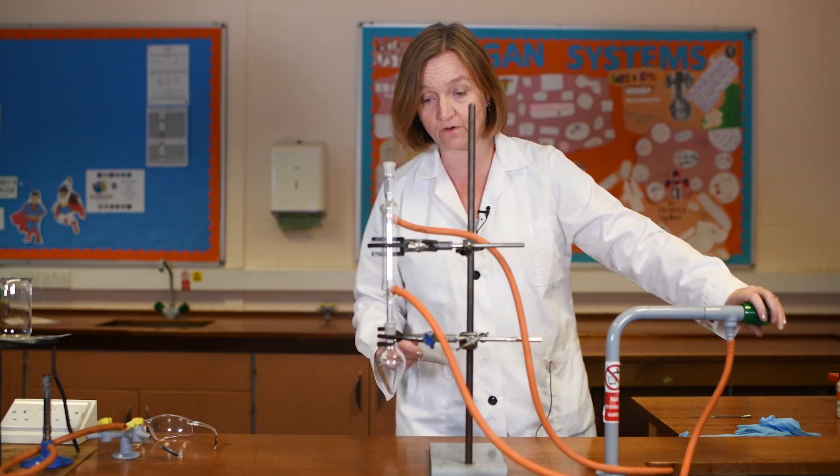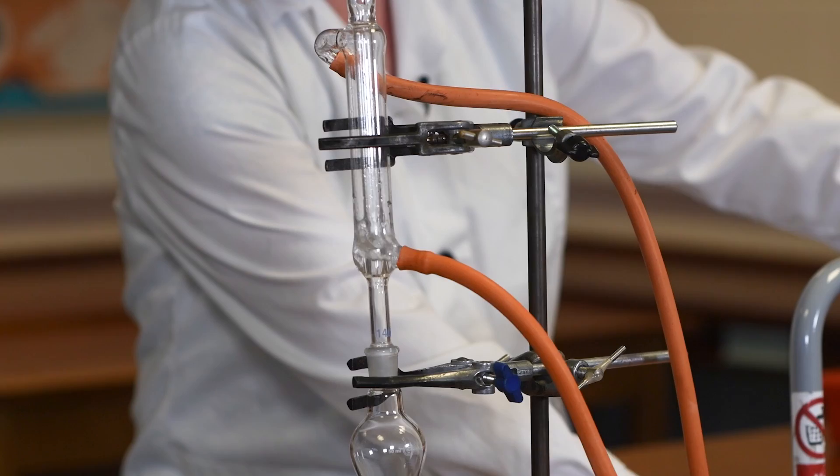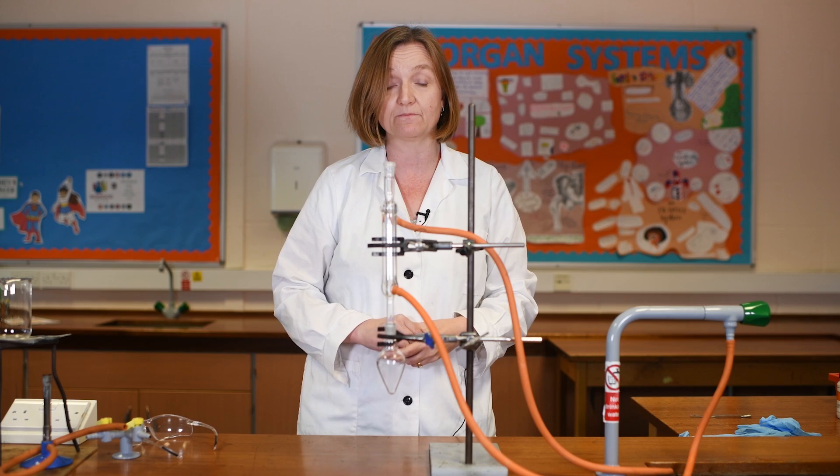As I turn the water on, if you watch at the bottom here, you can see the water bubbling up and then it comes out of the tube at the top and runs back into my sink.